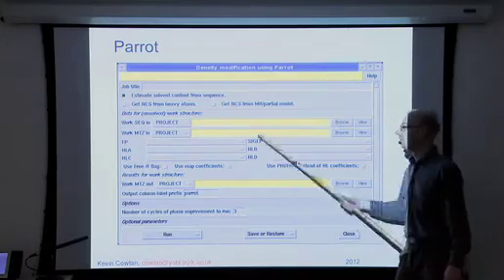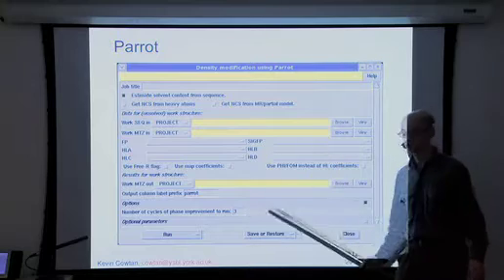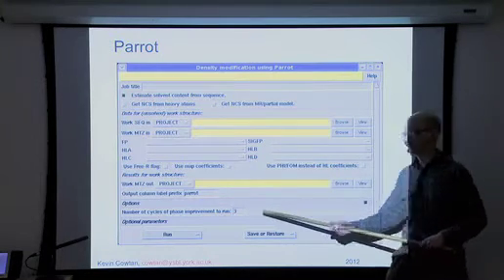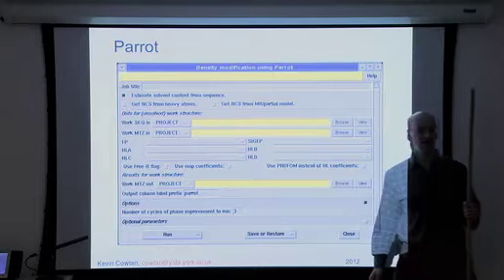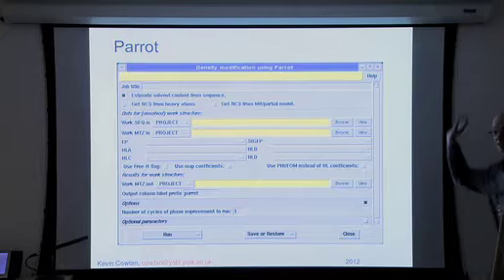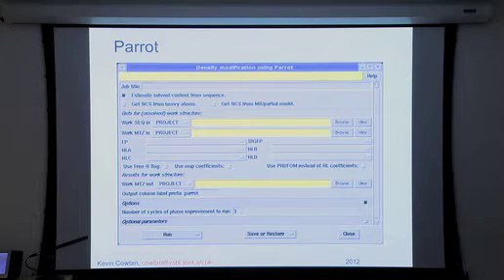In that case, you may want to increase the number of cycles of phase improvement. It runs 3 by default, which is a good compromise between improving the maps as much as possible without overly biasing them. However, if you've got NCS, then you can increase that. I usually start with 10. There are extreme cases where you can run for hundreds of cycles and get an improvement, but it's such a quick calculation that you can just try it and look at the maps.